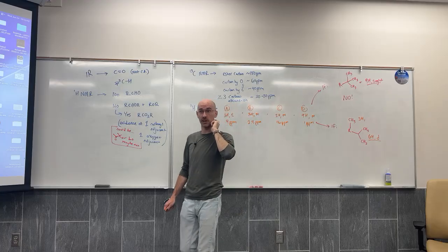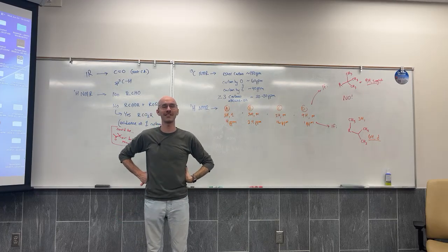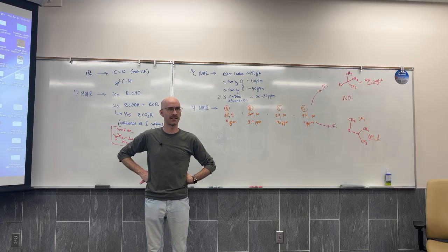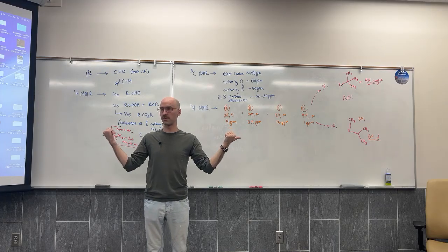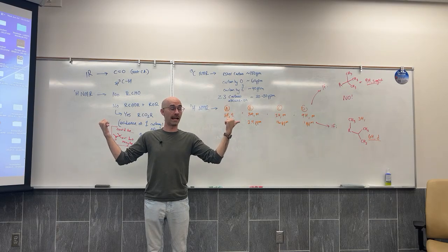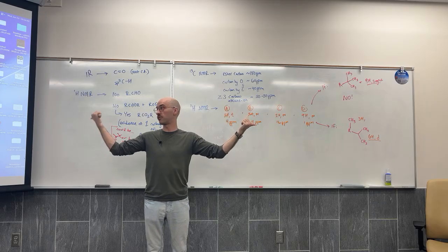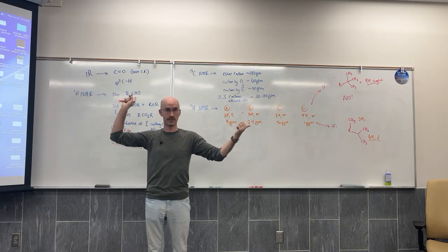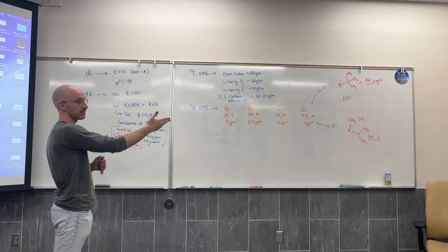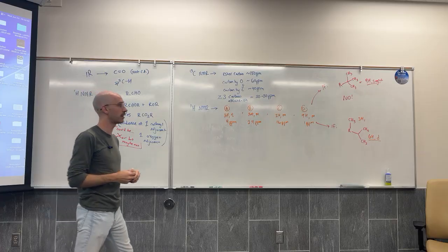That's the weirdest part. And so if I went to Saray's house and I said, wow, your front door really makes it look like you have 5 neighbors. How is that distributed? Then Saray could say, well, I have 3 neighbors over there and 2 neighbors over there. That's a family of 2 and that's a family of 3. Or actually, I've got 3 neighbors. There's 2 neighbors over there and 2 neighbors over there and 1 neighbor that way. There's different ways you can get 5 neighbors, but if this is our setup, those 6 hydrogens have 1 neighbor, so their signal becomes a doublet.